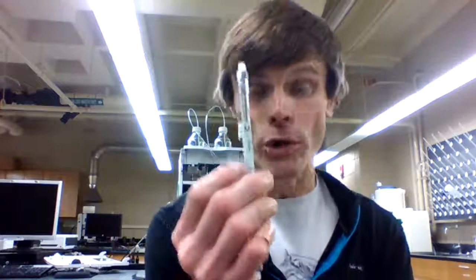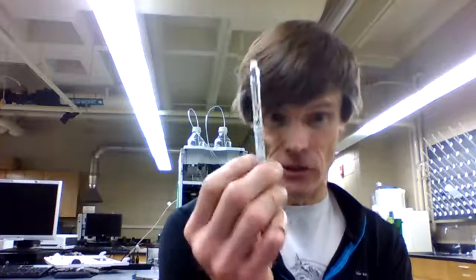It's going to be a polar column, and it's a polar stationary phase. And normally, in these cases, no pun intended, we're going to run a non-polar mobile phase. Mobile phase is important in this case. Mobile phase helps to remove substances from our column.